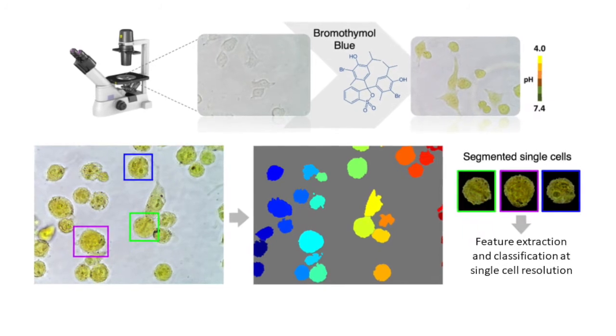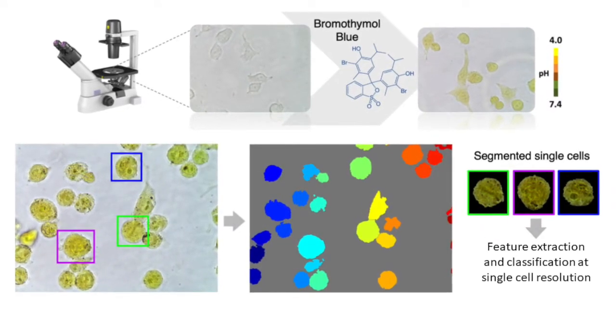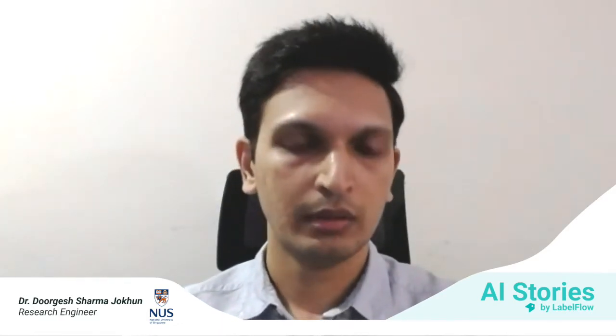Not as well as identifying a cancer cell from a normal cell, but the accuracy right now for differentiating between different types of cancer cells is around 70% at single cell level, and based on our pH imaging. However, now that we are going forward in this direction, we are going to focus more on trying to distinguish these different grades. And we already have a few ideas in mind of how we can improve this accuracy. So instead of using just the pH information that we get, we can also incorporate structural changes that happen as the cell progresses.